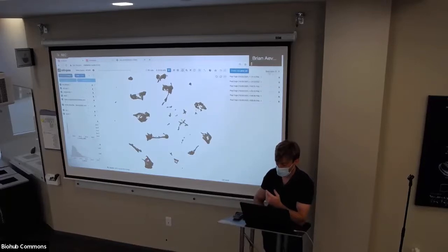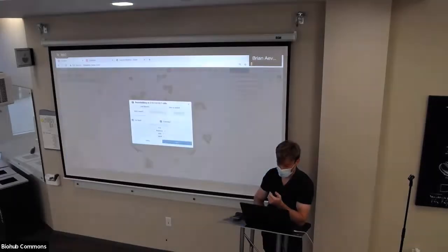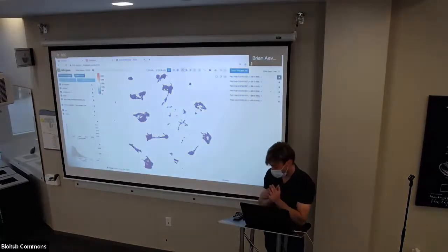What you can do is, here, this is clearly log transformed. The range of expression is small. Then we can switch to this thing. And now the range of expression is huge. So you can actually change which particular expressions you are looking at. And this is similar to the data layer option in the pre-processing, like which data layer you are going to be processing from. Okay, now that is it.